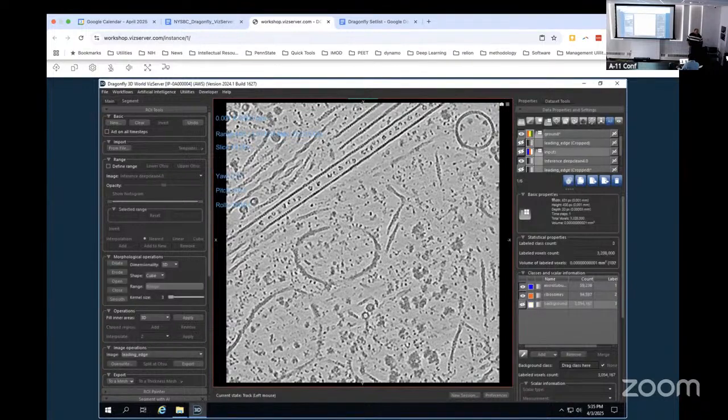And if you select it, you'll see that it has down here the 3 different classes. They aren't named or anything yet. You can just double click in these and name them whatever you want. I'm going to call the first one microtubules or just MT. I'm going to call the second one ribo. And the third one background. Now, I'll wait till everyone's done with that.